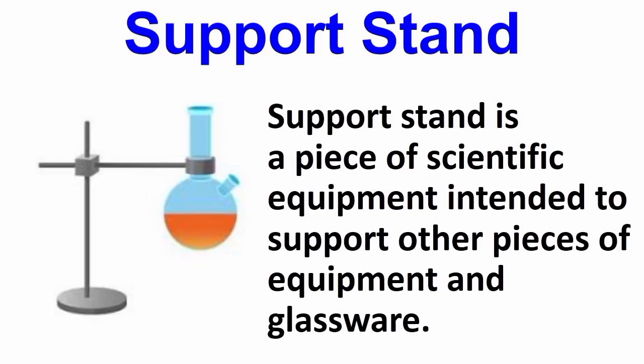The retort stand is a piece of scientific equipment intended to support other pieces of equipment and glass.